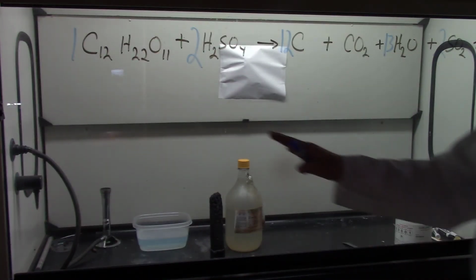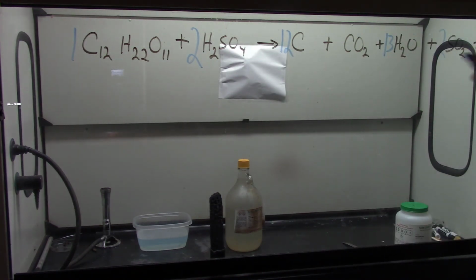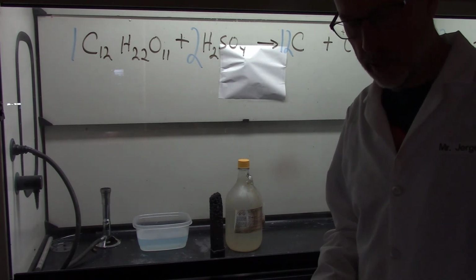So this is a really cool reaction in which we have 2 very large compounds that are being broken down into a bunch of small compounds kind of at the same time. So that's really 2 decomposition reactions occurring at the same time. Okay, and so that is reaction 6.